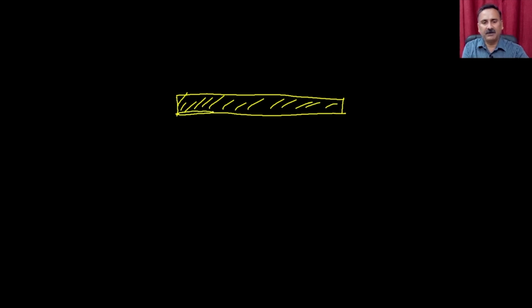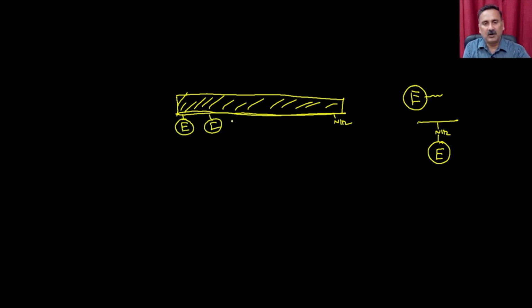On this metal surface, suppose I want to choose an enzyme. Okay, so this metal surface is going to be functionalized. Suppose it has the amino group, right? So if this metal surface has an amino group, I can use this and couple the enzyme for which I want to calculate the dissociation constant. So what will happen is that the enzyme is going to couple to the surface on this side, right?